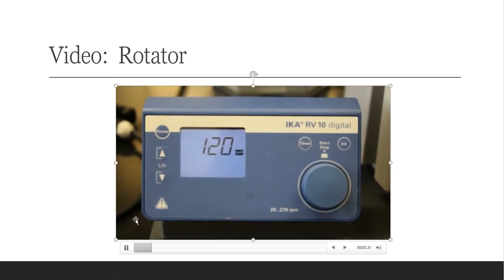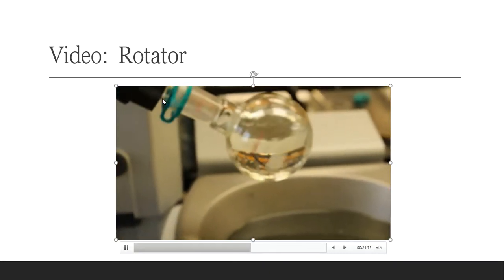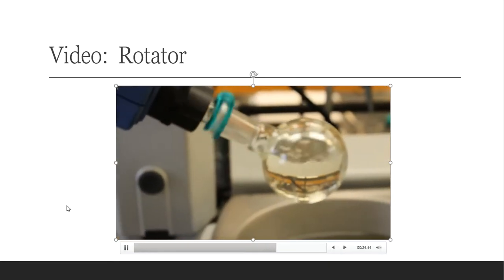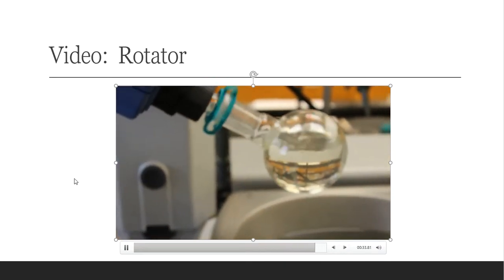So the control that you're seeing here is called the RPM control, which is how fast this flask is going to rotate. All right, so right now it's set at 120. If I just push the button and turn this on, you're going to see this flask begin to rotate. Well, I can turn this knob to the left or to the right, and I can get this thing to go faster and faster and faster. This increases the evaporation rate, so that way it will go over to the other side at a much quicker time frame.